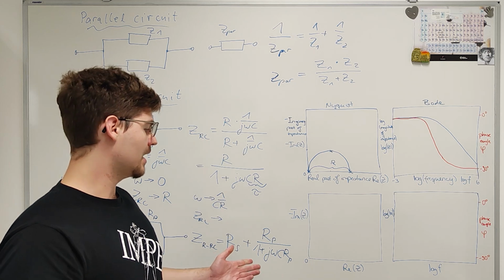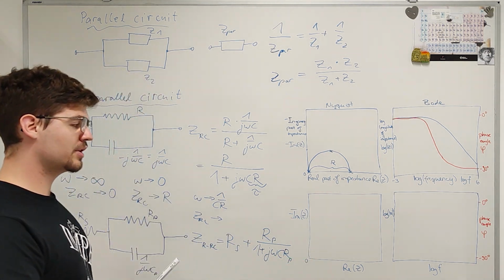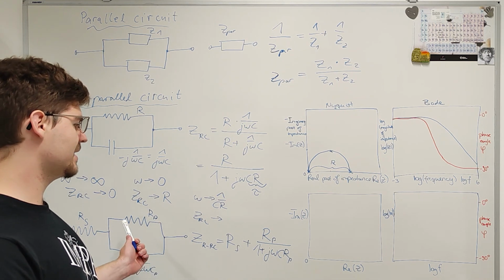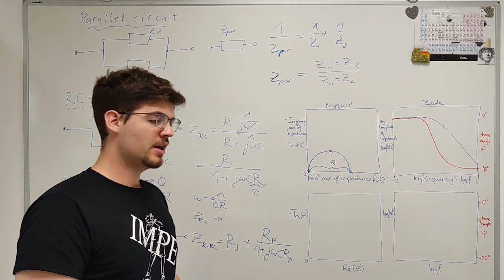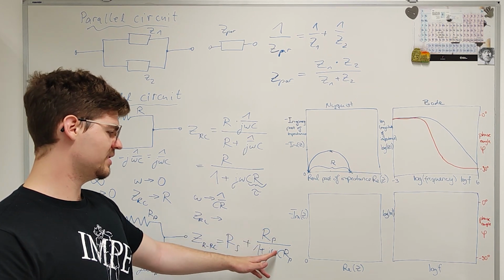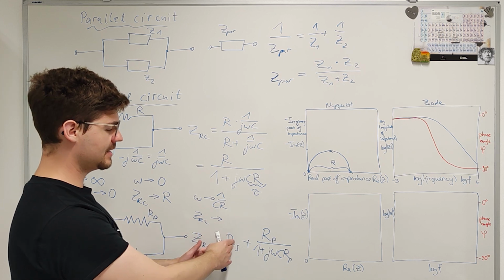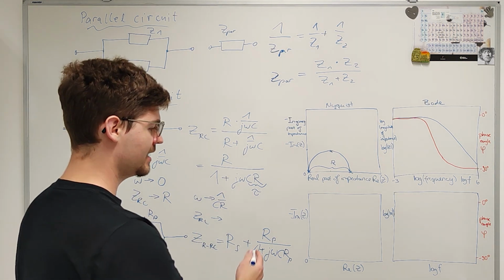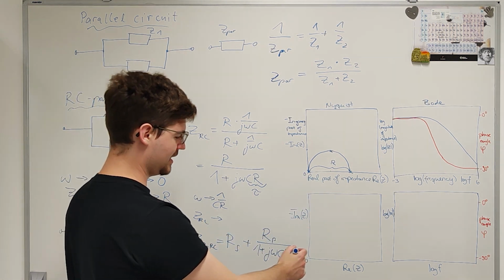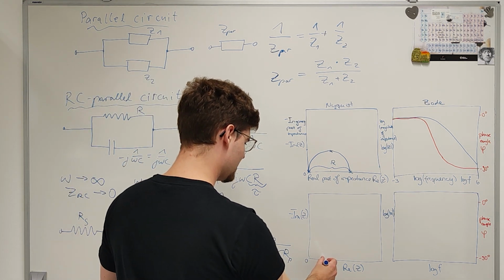And now all the same kind of analysis applies again to find out a spectrum. First, let's look at the characteristic point where the frequency tends towards infinity. If the frequency gets very high, again this term tends towards 0, and all that remains is now not 0, but the resistance R. So we will begin not at 0, but already at the offset R series, which is here.